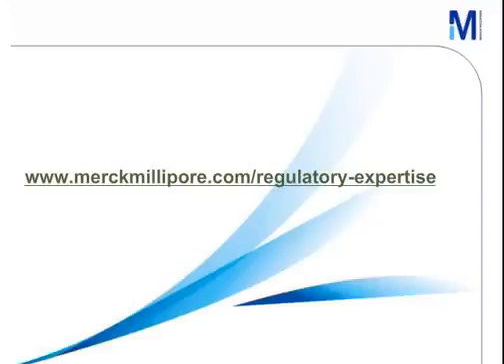Next question. Can I use more than 5 passages for a microbial strain? ATCC recommends not more than 5. We discussed this question at length in our ISO group, and we know that 5 passages are given in the pharmacopoeia. The ISO 11133 does not mention these 5 passages, but the frequency of the passage should be documented by the lab itself. Okay, next question.